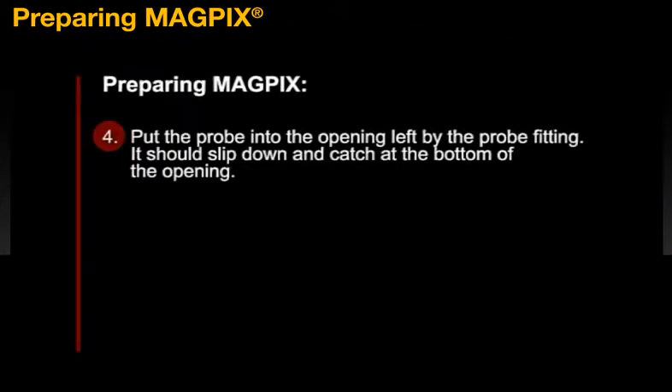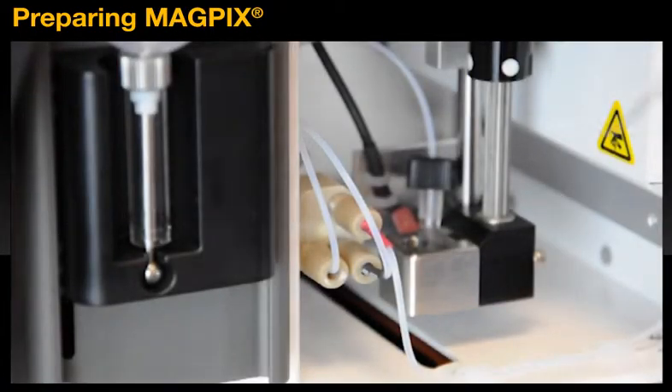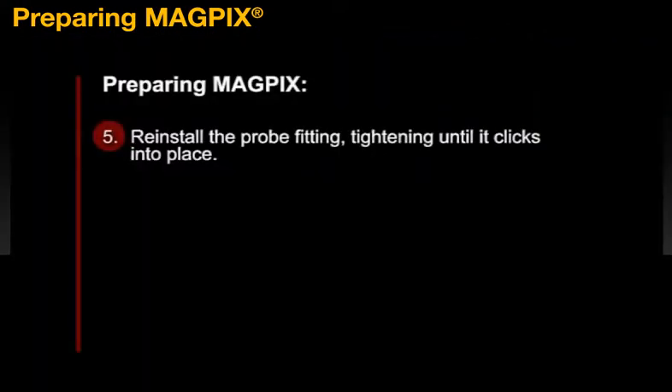Your fourth step, put the probe into the opening left by the probe fitting. It should slip down and catch at the bottom of the opening. Reinstall the probe fitting, tightening it until it clicks into place.